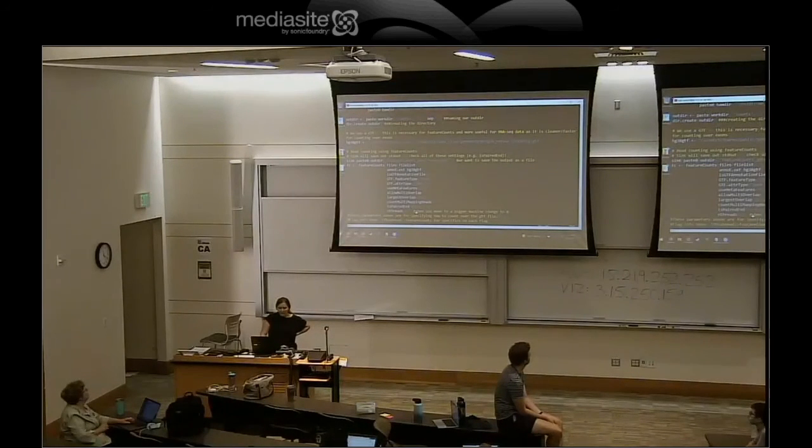And the way that this is set up is you can just do an sbatch of this out to your supercomputer. It'll, in this case, run on 4 threads. If you're running on a bigger computer, you would do 8. So typically this would just be 8. I pared it down for this because I thought we'd be running it. And then it'll paste a counts file into your out directory. So this is pretty similar to the scripting that you guys did last week. It's just using an R command itself to actually run the counts.